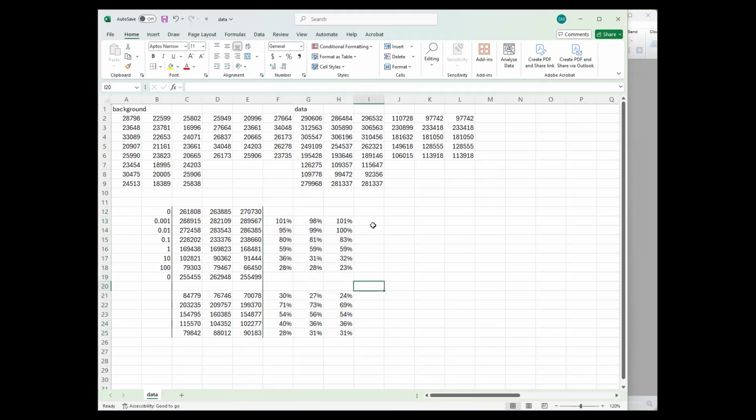All right, now what I want to do is take a log transform of my data. So I'm going to do log base 10. And I'm going to capture these wells. And that's another reason not necessarily to use the zeros, because you can't do a log of a zero, right? See, it gets confusing. It doesn't like that. So log transform your standard curve.